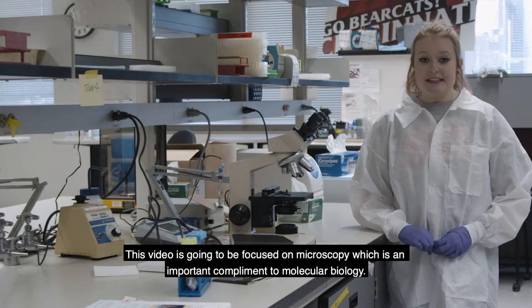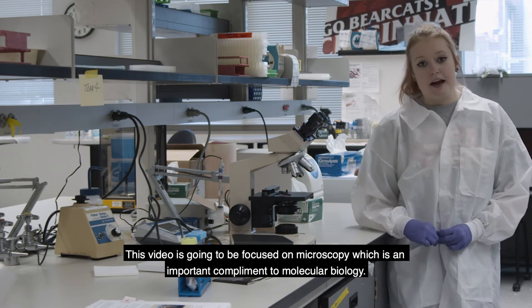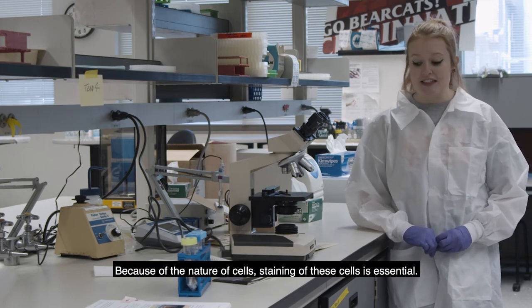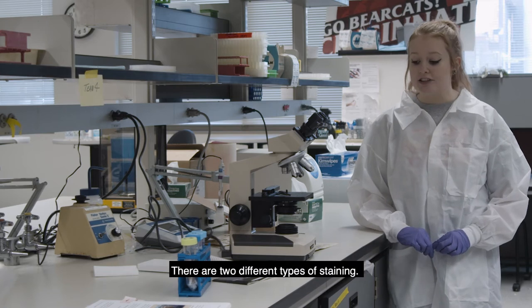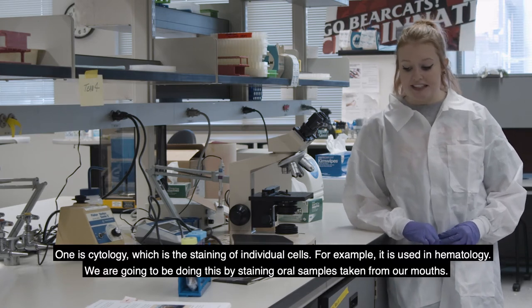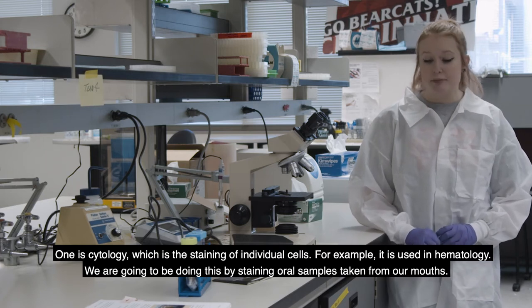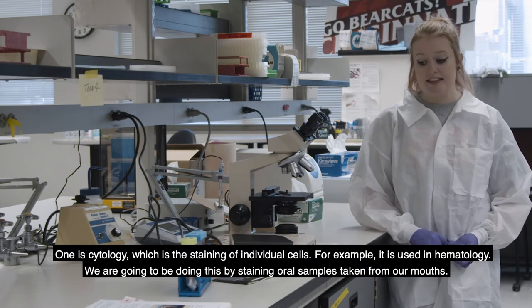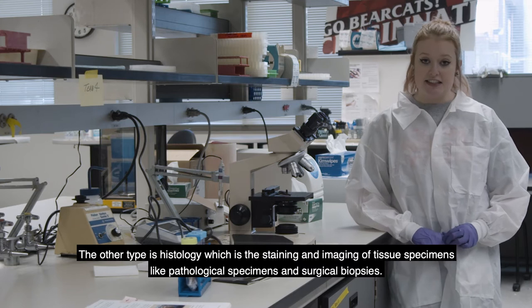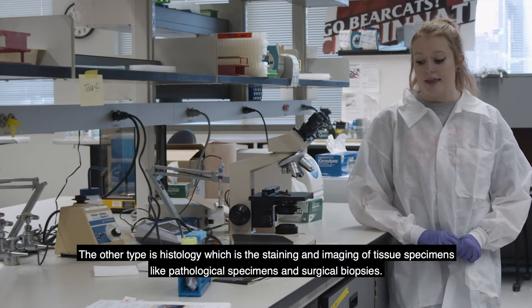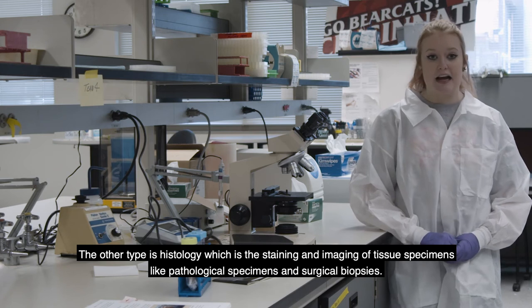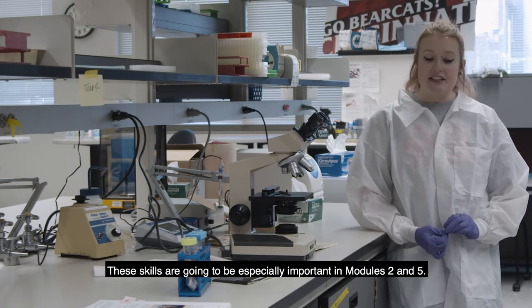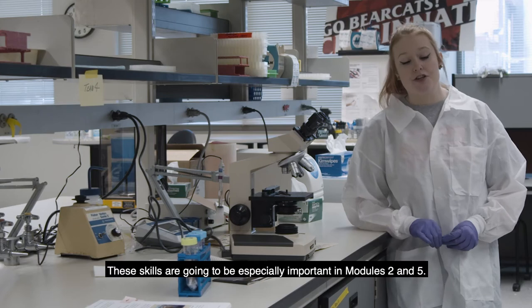This video is going to be focused on microscopy, which is an important complement to molecular biology. It's often used to reveal the details of disease progression. And because of the nature of cells, staining of these samples is essential. And there's two different types of staining. One is cytology, which is the staining of individual cells, for example, used in hematology. And we're going to be doing this by staining oral samples taken from our mouths. And then the other is histology, which is the staining and imaging of tissue specimens, like pathological specimens and surgical biopsy. And mice are a common model for human development and disease that are used in histology. And these fields are going to be especially important in modules 2 and 5.